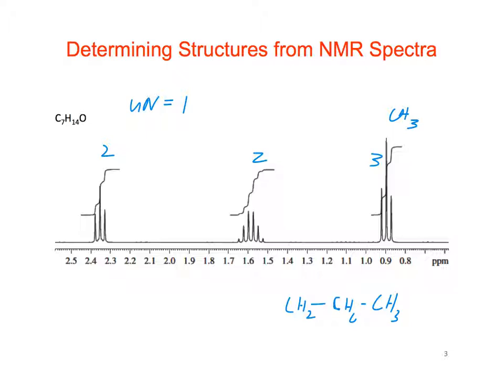There's got to be some symmetry, right? So what about the number of hydrogens? Together and double it. So we have to exactly double it, right? So it probably means that we have a CH2 over here, CH2, CH3, and those have to be exactly symmetrical. So what do we have left over? Just a carbonyl group, right?